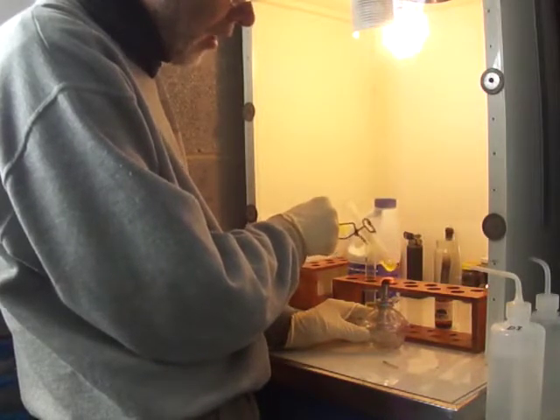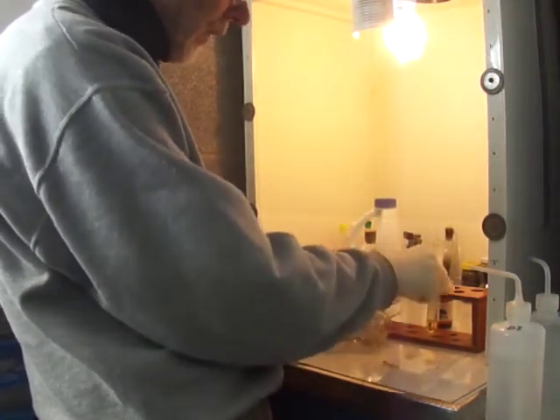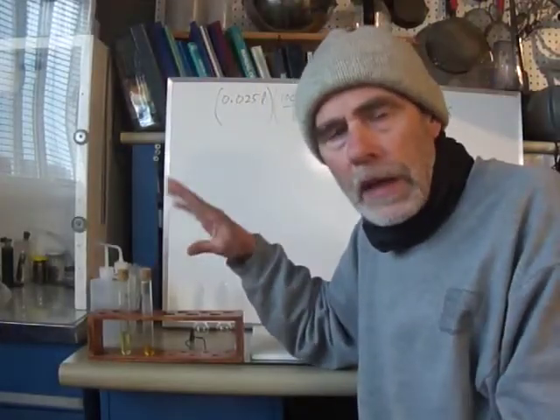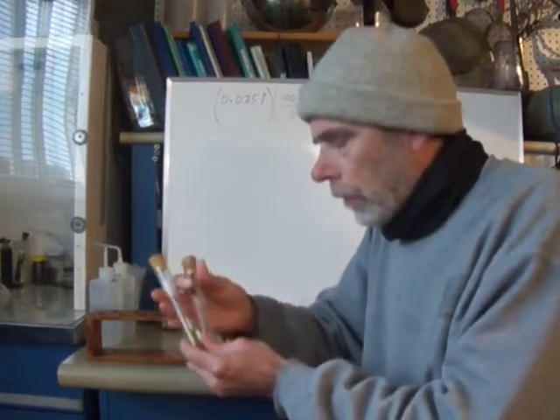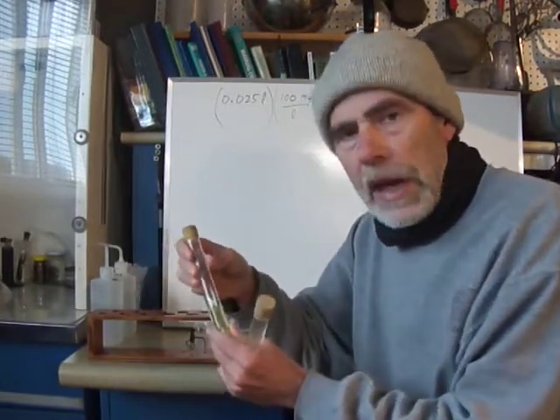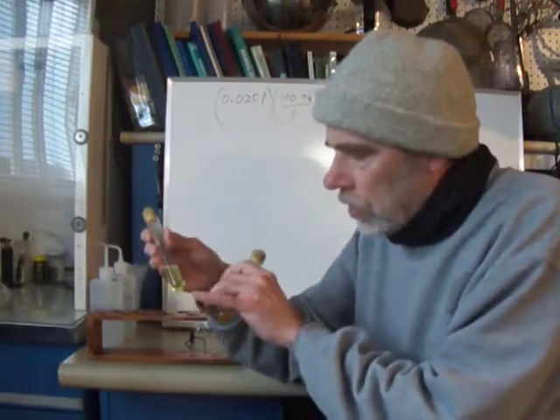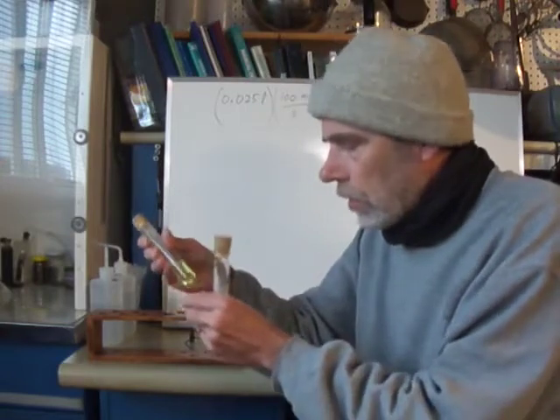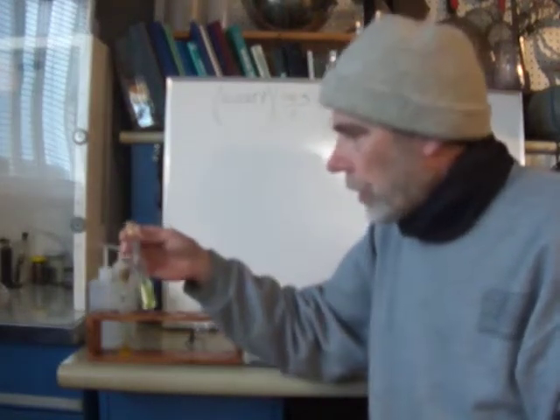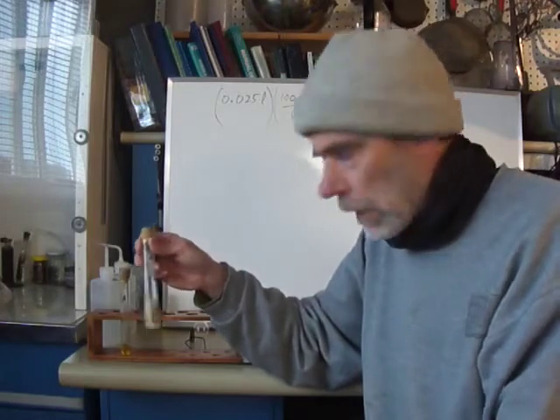It looks like something's going on because the color of the solution is changing quite a bit — I still see a little bit of gold down there. I'm going to let this sit for a while with a cork on it. I let both of these sit overnight, and the gold all dissolved. With the bleach I added a couple more mills to make sure it dissolved — that one went a lot slower. I checked the pH and it was still plenty acidic enough to keep free chlorine there to work on the gold. Everything dissolved except a tiny speck in each one, which I think is just dirt from the gold. I'm going to open this up in the fume hood and heat it to drive off some of the excess chlorine now that the gold is dissolved.